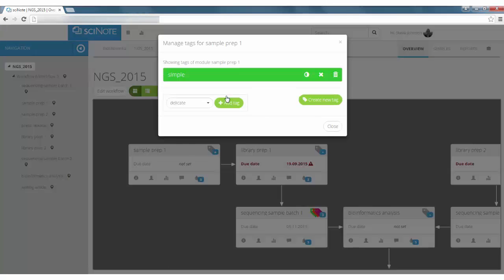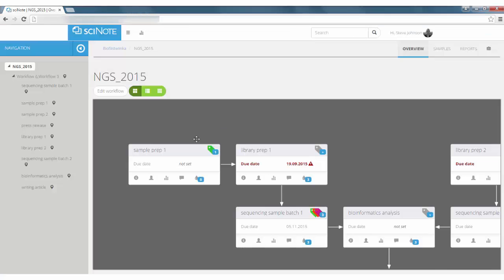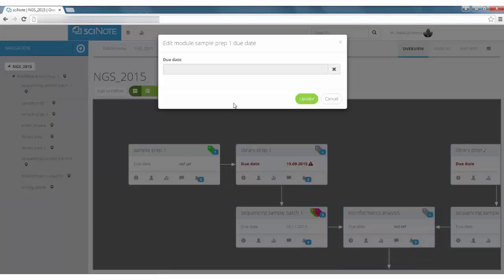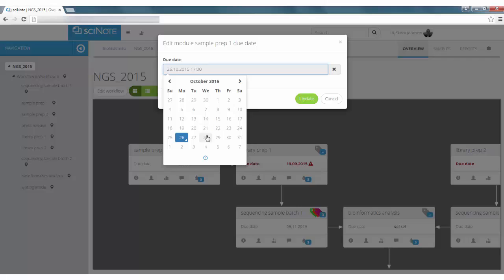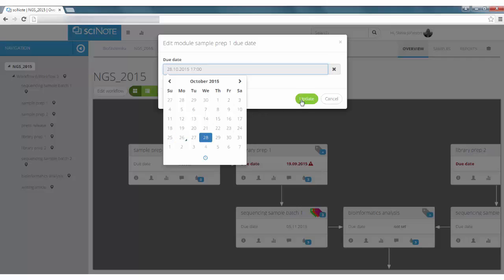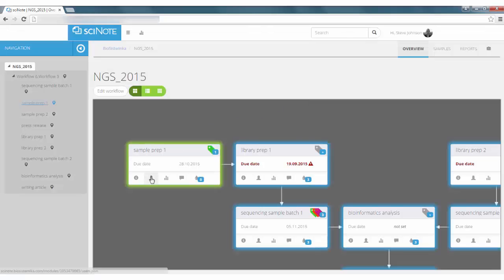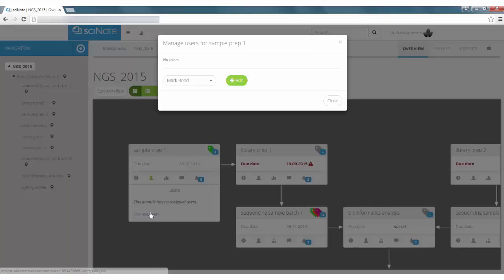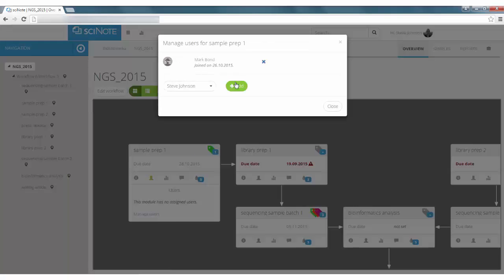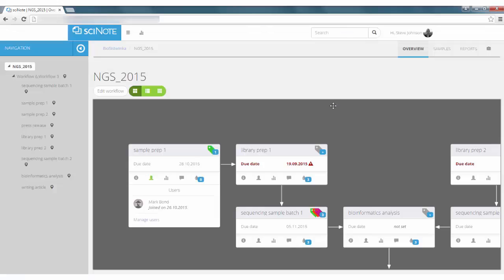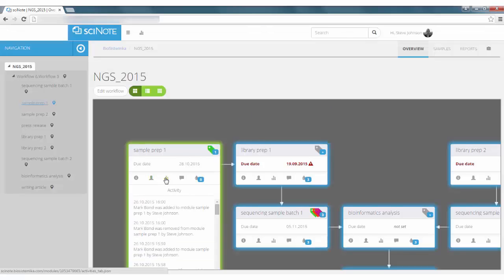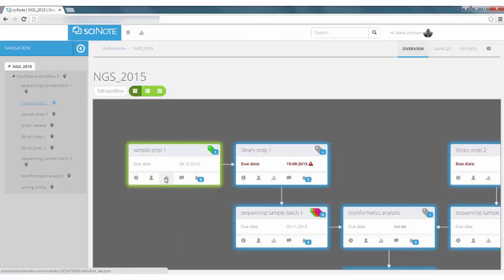You can also add tags to the module, set deadlines, assign the module to other team members and see all the changes.